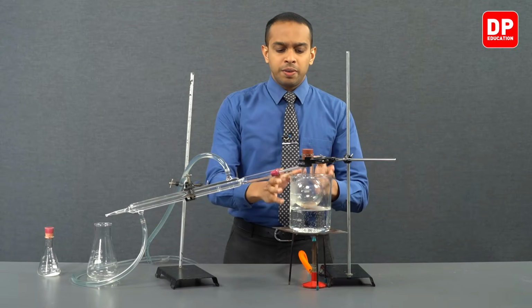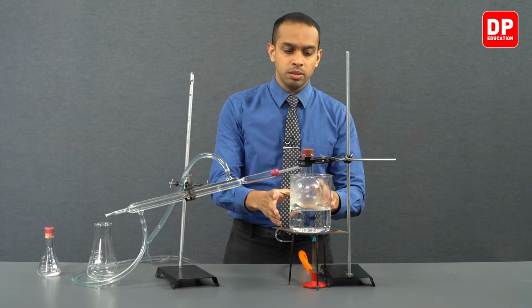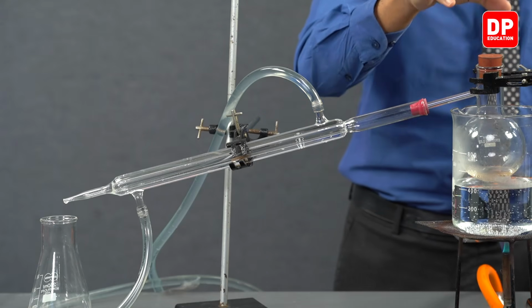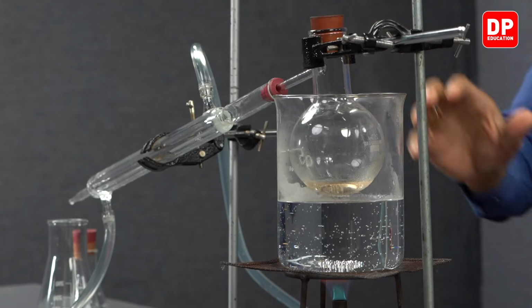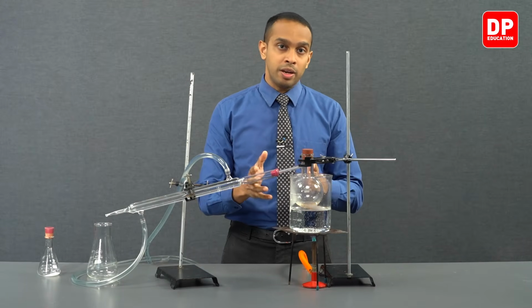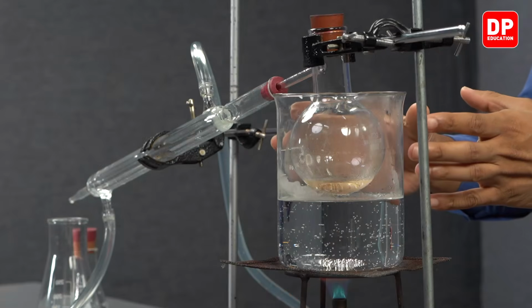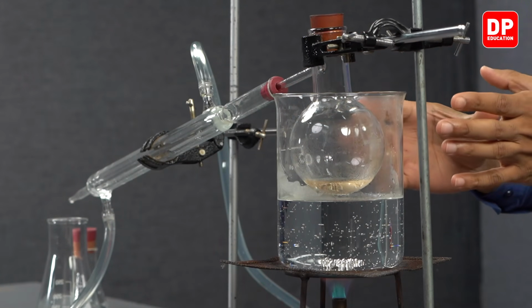Now students, as we heat this beaker containing water, steam will be produced, and as you can see, steam is produced here, and that steam is heating up this distillation flask and the contents in it. And as I mentioned earlier, the diethyl ether layer is going to get evaporated, leaving behind the essential oil, and we can see the diethyl ether layer has gotten smaller in volume here.